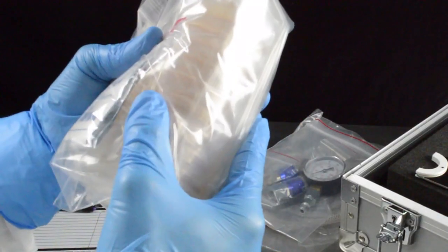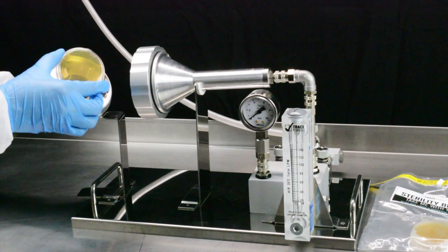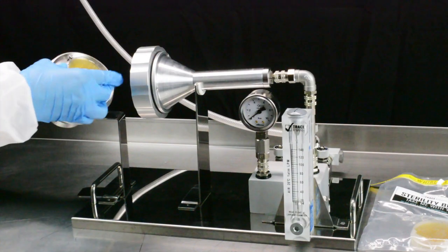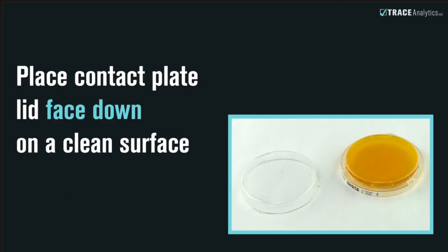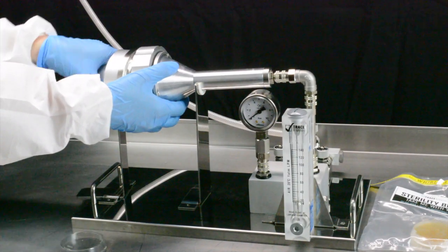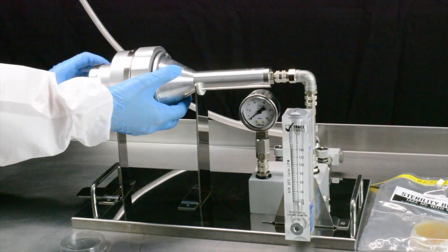Be careful opening the sealed package as the plates are unlocked. Remove a contact plate from the package, ensure the agar is intact, and place it inside the plate housing using the housing clips. After removing the lid, place it face down on a clean surface. Immediately screw the contact plate housing closed gently. Too much force can result in the plate falling off the clips.